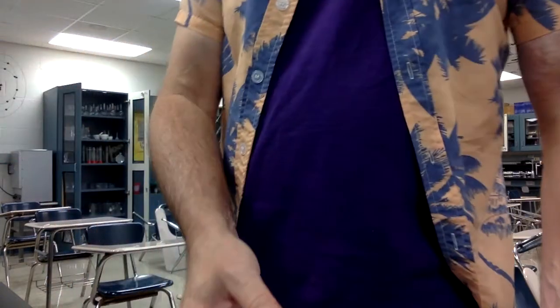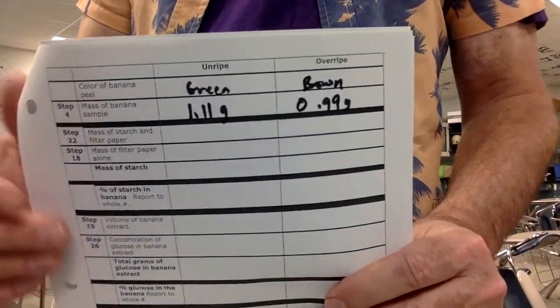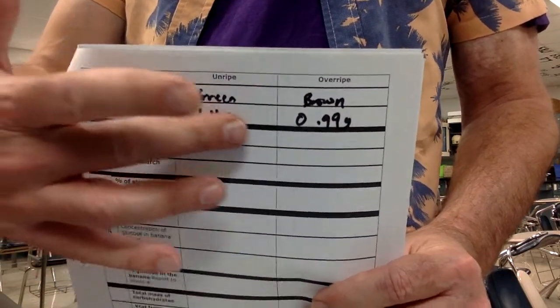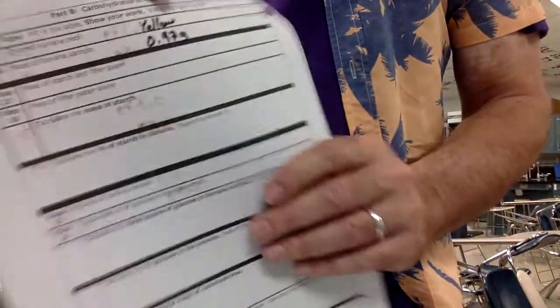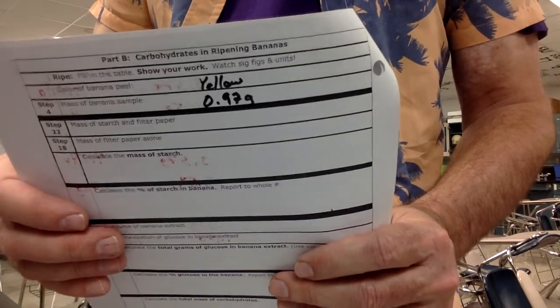But we're just working on the green for now, but for data's sake, I can show you that the green banana weighed 1.11 grams. The brown banana sample weighed 0.99 grams, and the yellow banana sample weighed 0.97 grams. So I did a pretty good job of getting about 1 gram on each sample.